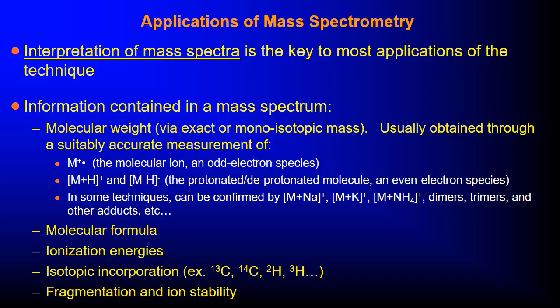Then we also have the protonated molecule, an even electron species. In some techniques this can be confirmed by the dimers, trimers, and other adducts.